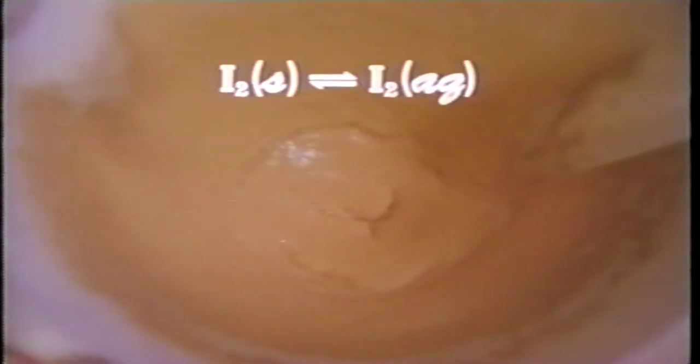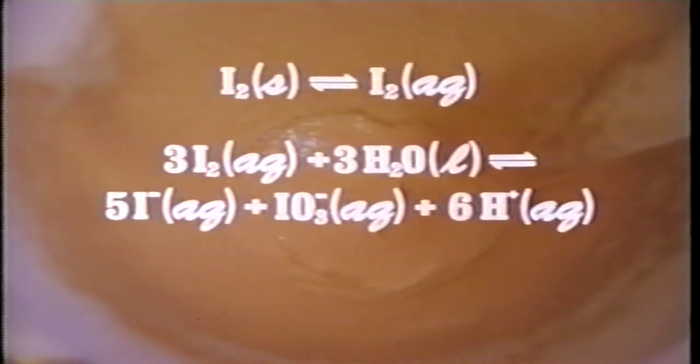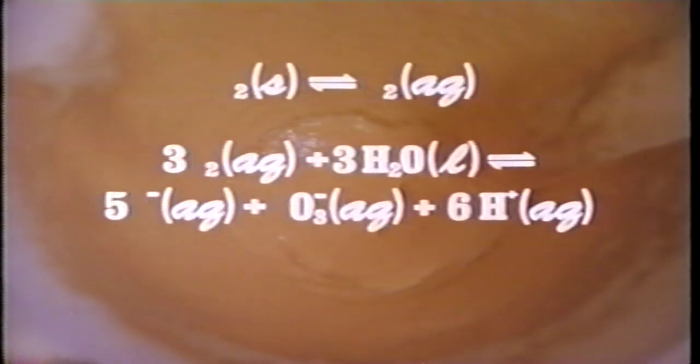We added solid radioactive iodine to the saturated solution. Though solubility equilibrium existed, radioactivity was soon found in the solution. The dissolved iodine reacts with water. Because this chemical reaction is also a dynamic equilibrium, radioactivity appears among the iodide ions and iodate ions. Thus, when lead nitrate is added, some of the solid lead iodide formed is also radioactive.